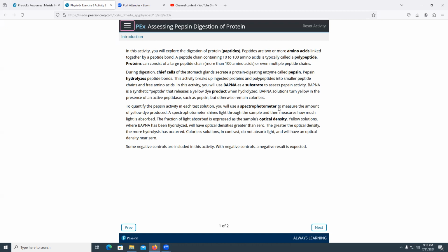So you need to understand optical density. So the higher the optical density, that means the more product we have, the more substance in the solution, they will impede and interfere with the passage of light coming from the spectrophotometer, and then less light will transmit and more light will be absorbed. More light will be impeded, indicating high optical density. But low optical density means that a lot of light is passing through unimpeded, uninterrupted.